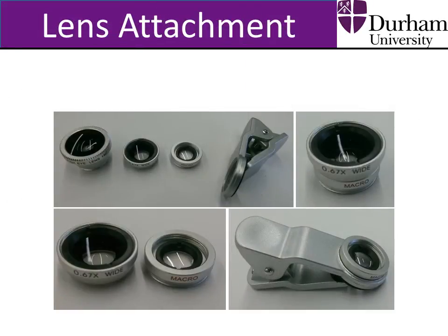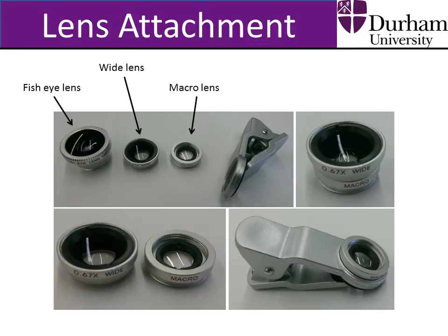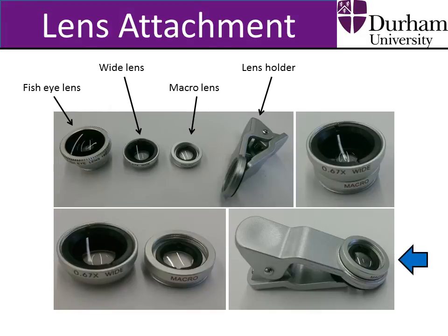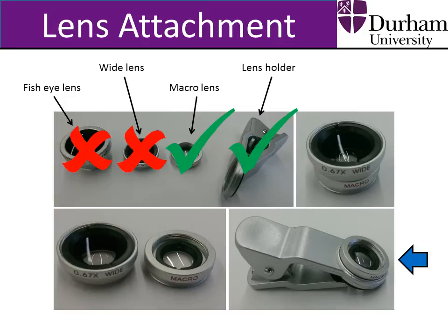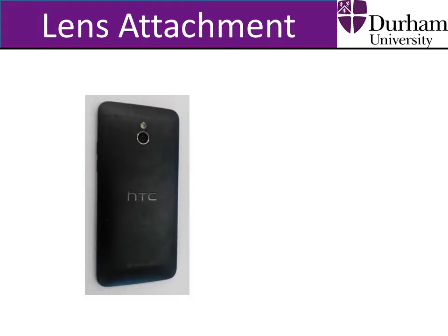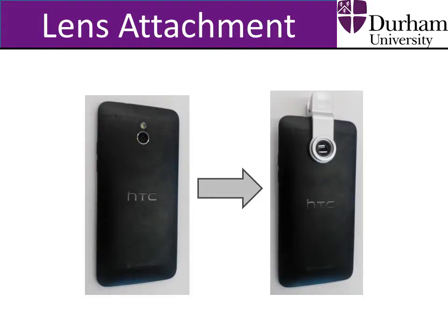To use this method, remove the lens attachment components, which consist of the fisheye lens, the wide lens, the macro lens, and the lens holder. The wide lens may be attached to the macro lens. If this is the case, unscrew the macro lens from the wide lens, and then screw the macro lens into the lens holder. The other lens attachments are not required in the contact angle measurements.